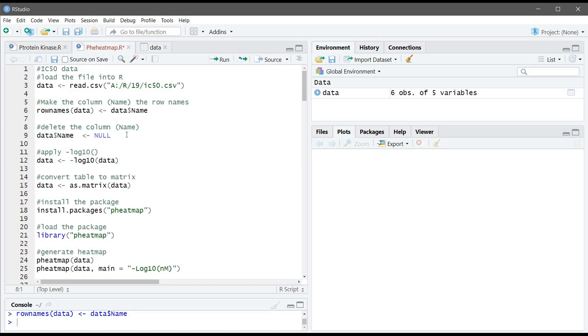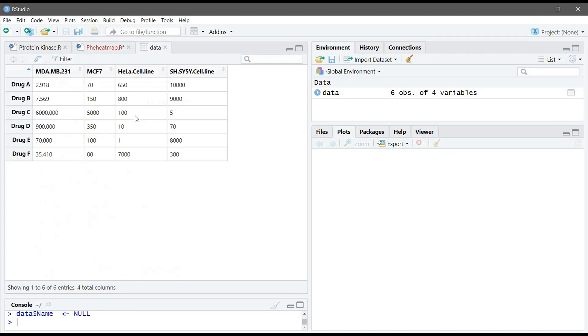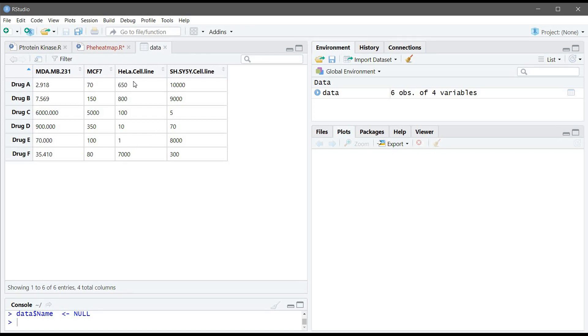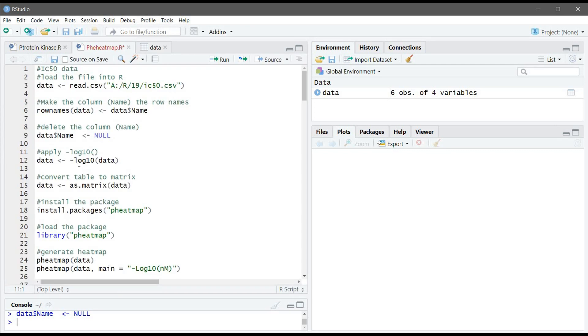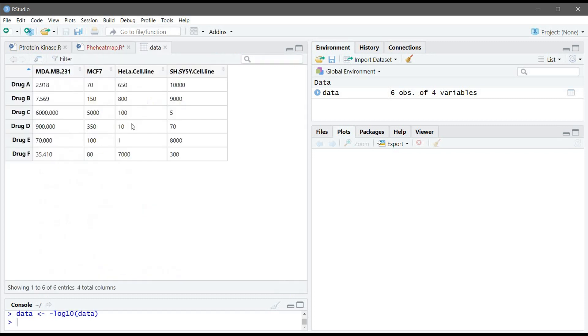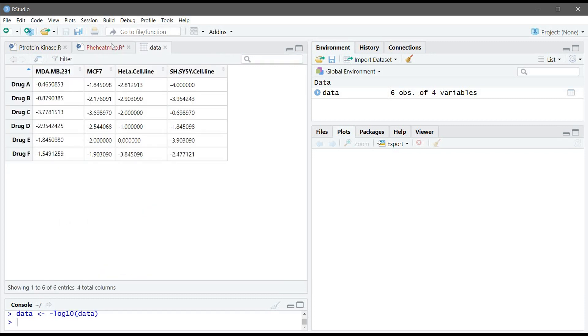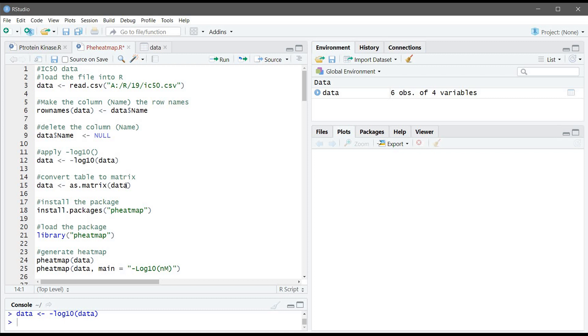So since this is IC50 data we are more interested in the small data. If we generate a heatmap like this we won't be able to see those small IC50 because the big numbers will overcome those small numbers. So what we need to do is we need to use the minus log10 function so we will have a better visualization for the IC50.